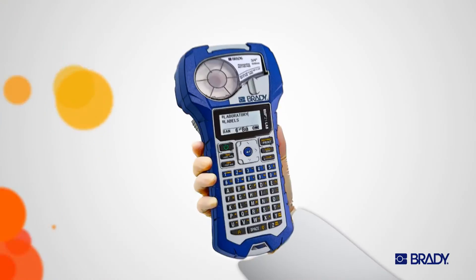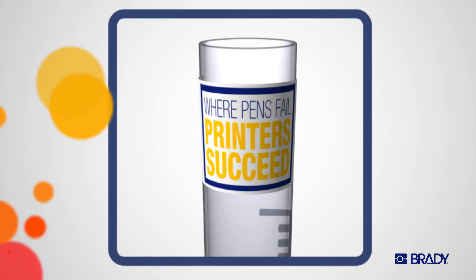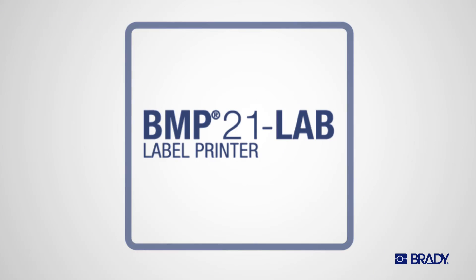Grab a BMP21 Lab Laboratory Label Printer from Brady. Hard at work in laboratories every day.